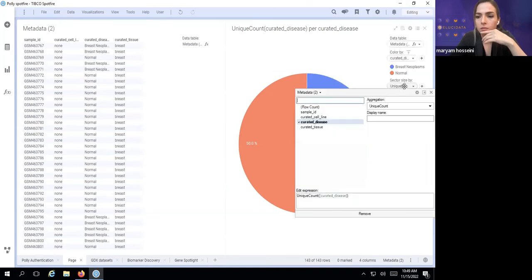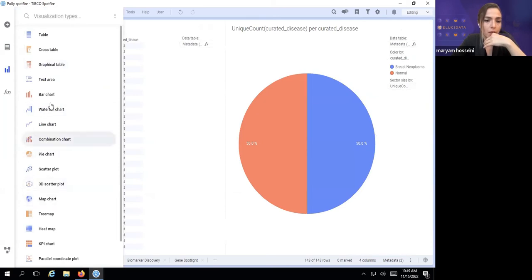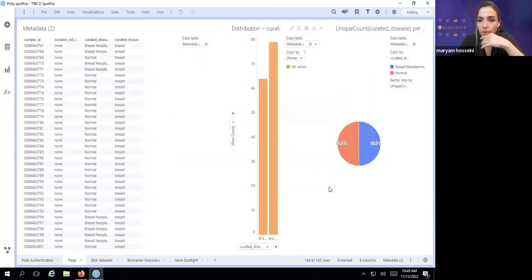And these are different options that you can also change based on size and so forth. One other thing would be, say, for example, having a bar chart. So I can, if I don't want it to be here, I can just click on it and put it here or at the bottom.